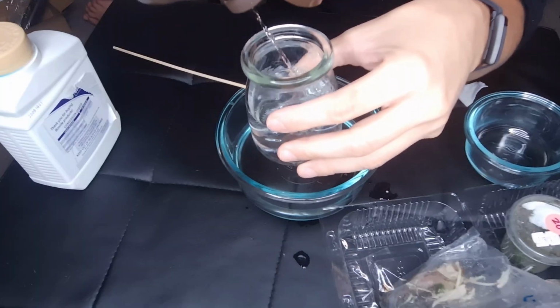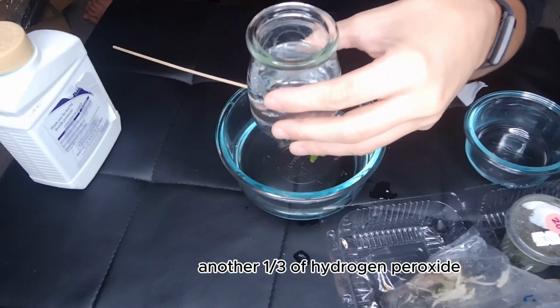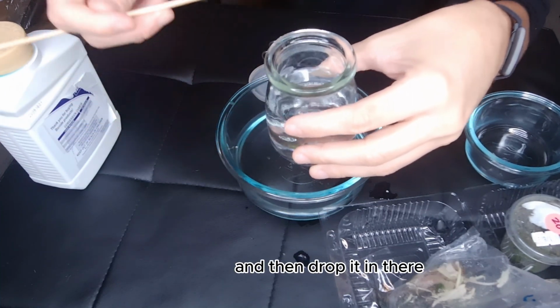And then another third of hydrogen peroxide. Then we're gonna fish our little plantlet out and then drop it in there.